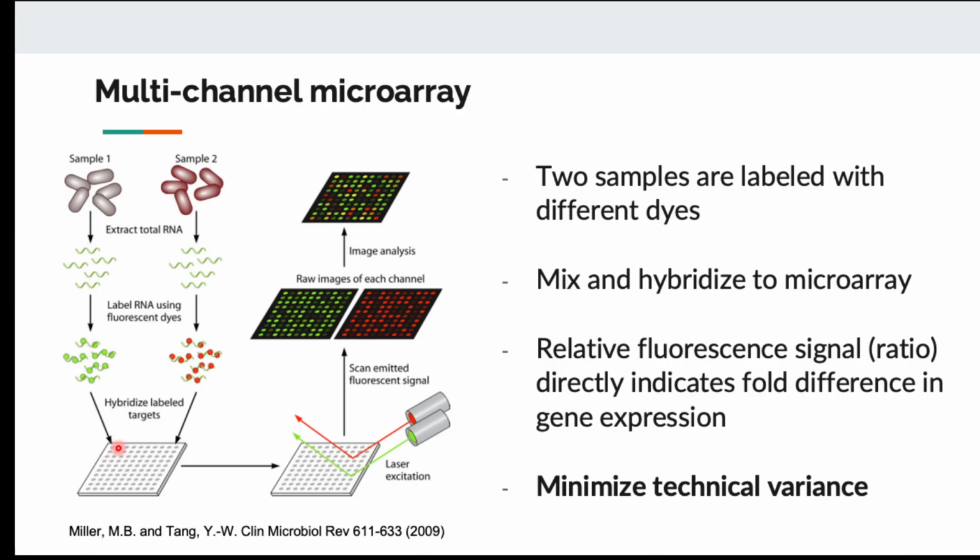So they're going to bind to the same microarray spots. But because they are from different samples and tagged with different fluorescence, when we activate the fluorescent signals at a certain location on the array, the amount of green signal and the amount of red signal that we get is going to be proportional, roughly, to the amount of RNA for that gene at the same position.